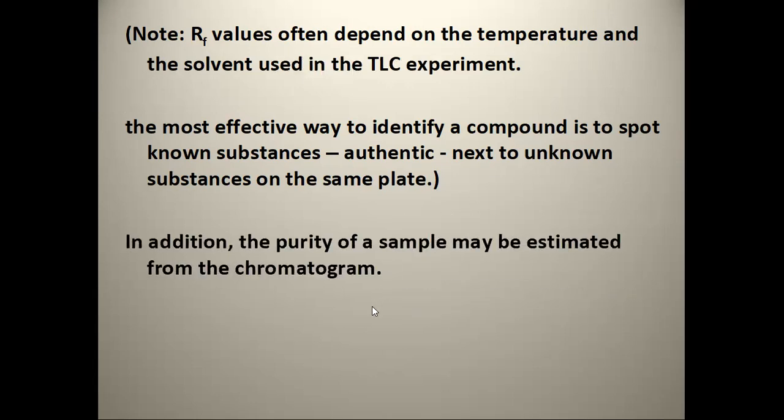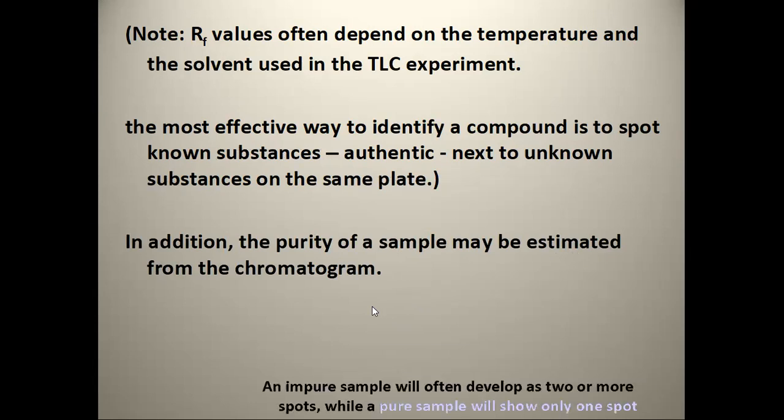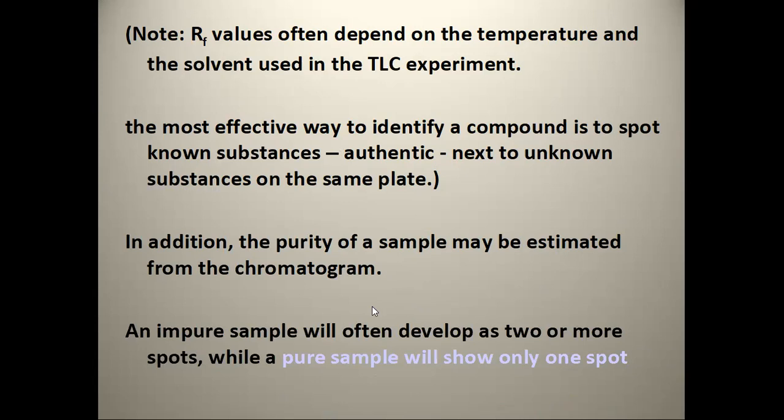In addition, the purity of a sample may be estimated from the chromatogram. An impure substance will often develop one or two or more spots. Yung pure sample kasi made up of only one molecule. So that means only one type of intermolecular interaction. So hindi magsa-separate yun.